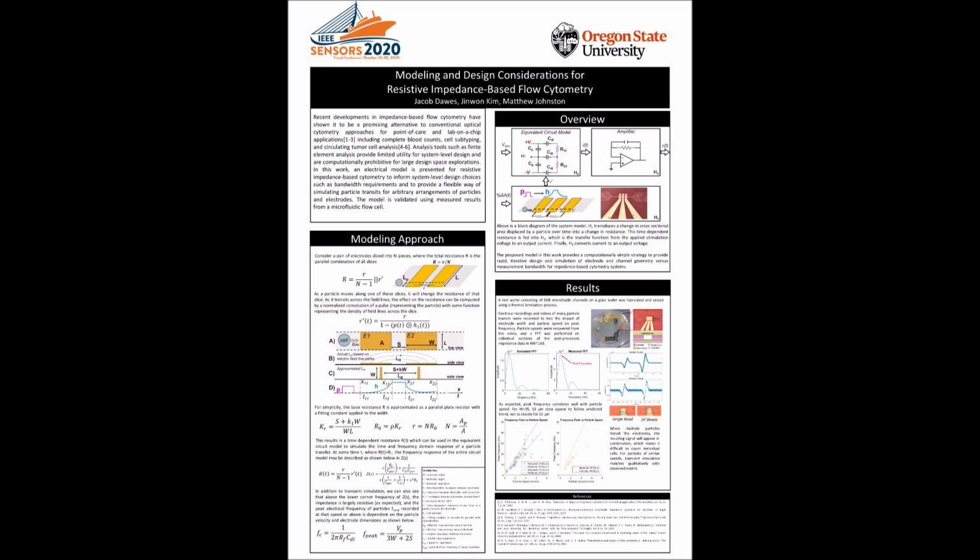Thanks for dropping by our virtual poster on modeling and design considerations for resistive impedance-based flow cytometers. So just to make sure that we're on the same page, flow cytometry, if you're not familiar, is where you are counting and often characterizing populations of cells. This is conventionally done with an optical approach, but recent developments in impedance-based flow cytometry have shown it as being a promising alternative or something to use in addition to the optical approaches. This is especially the case for point-of-care applications where it's important to reduce the amount of infrastructure and high-cost components.